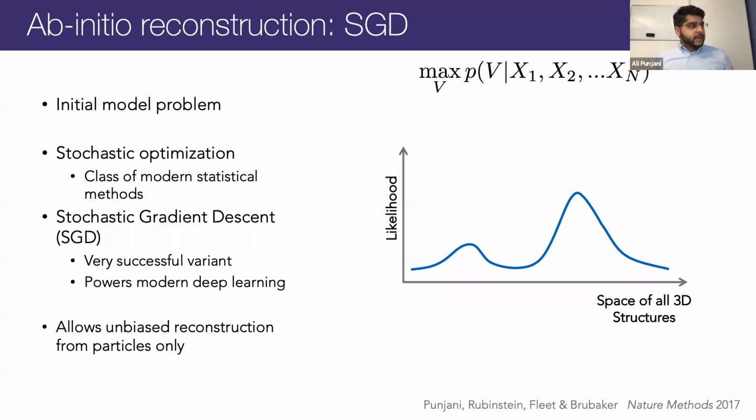We saw yesterday that what ab-initio reconstruction does is use a stochastic optimization algorithm. Oops. Sorry. Do you still see my screen? Yes, yes. Strangely, my monitor has turned itself off. Sorry, just give me a moment.